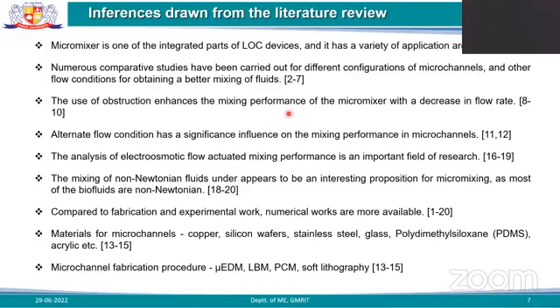The use of obstruction enhances the mixing of the micromixer with decreasing flow rate. Instead of steady flow, if we give some alternate flow, it will also influence the mixing. And the electroosmotic effect, as I told, if we add it within the micromixer or microchannel, we also get better mixing. This is also an important field of research. And as we know, mostly all biofluids are non-Newtonian, so the mixing of non-Newtonian fluids is also a very interesting topic of research.